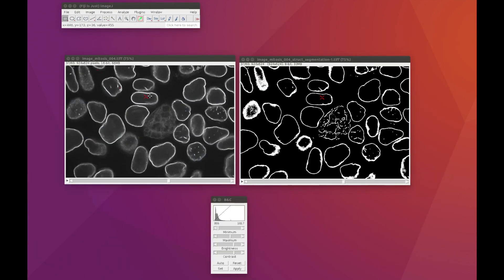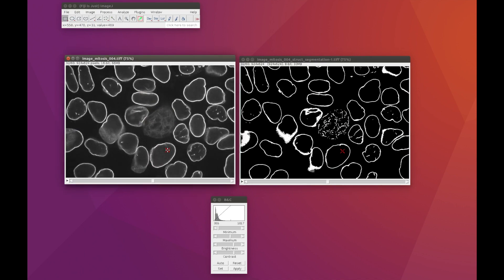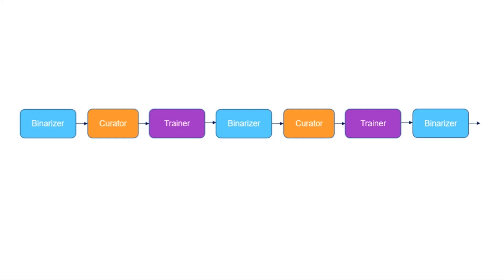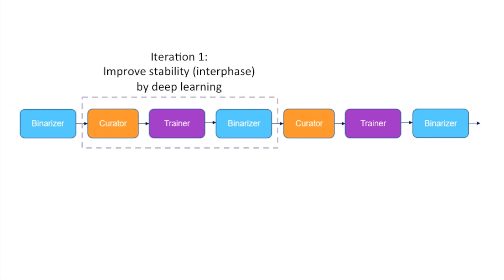We'll start by looking at some examples of the images we're going to segment. On the right you can see an example of the final segmentation we'll be able to get by combining classic approaches with machine learning. Here you can see a mitotic cell, and here you can see some interphase cells. Morphologically, Lamin B1 can be very different depending on the cell state. As a starting point for our machine learning, we'll use a classic image segmentation workflow that's effective at segmenting interphase cells.